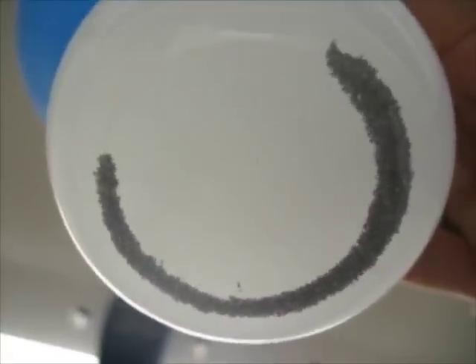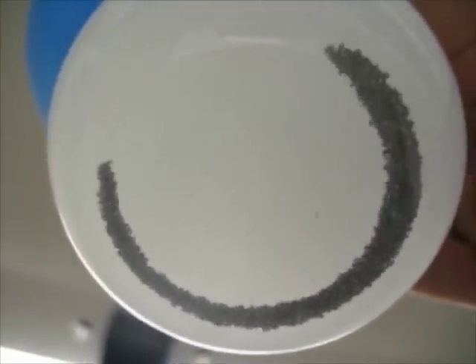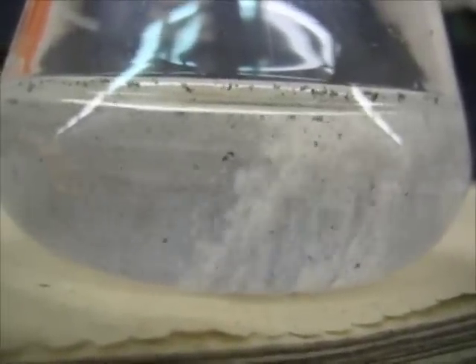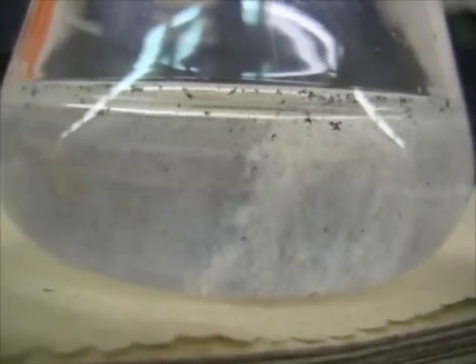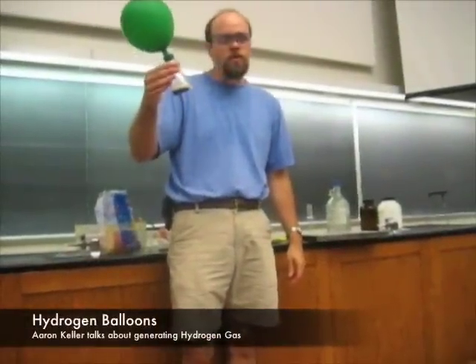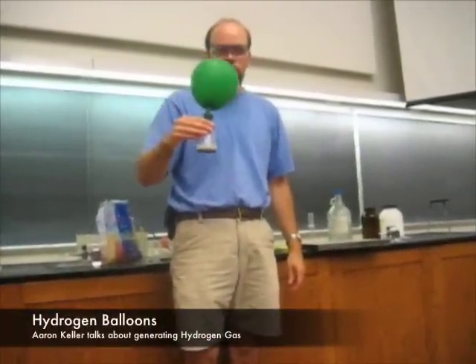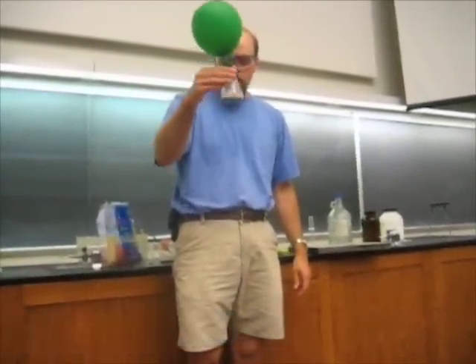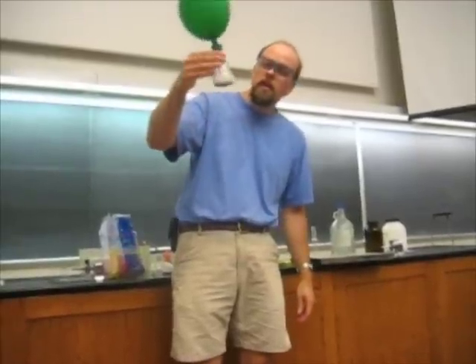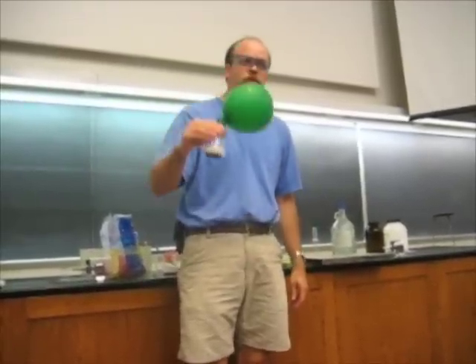We've almost used up all the zinc at this point. Today we're going to do a demonstration with hydrogen gas. I'm generating the hydrogen gas by dissolving zinc metal in hydrochloric acid.